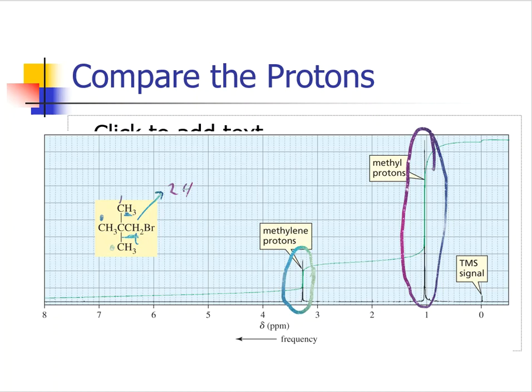So in the previous video, I led you down this discussion of chemical shifts relating to particular hydrogens, or protons, within a molecule. And we talked a little bit about electronegativity. We said, listen, an electronegative atom is very electron greedy, and it's going to suck all of the electrons around it.